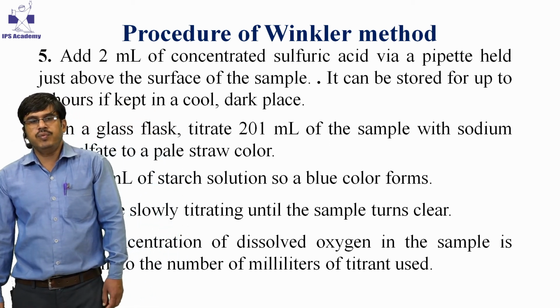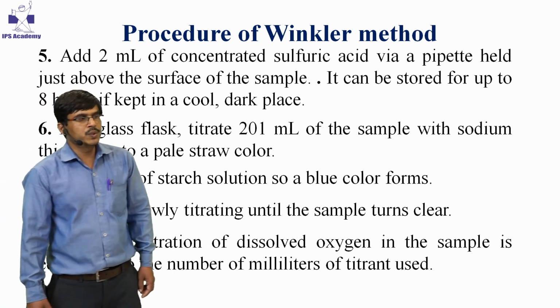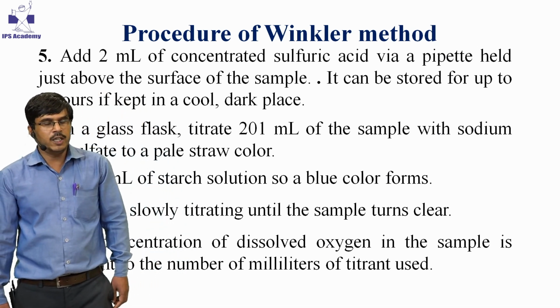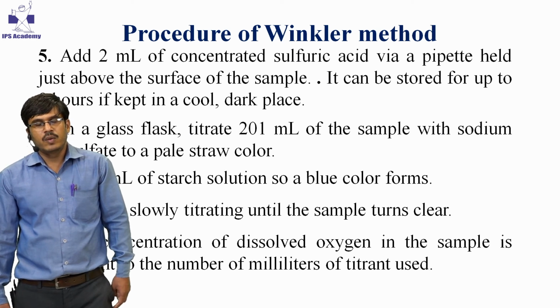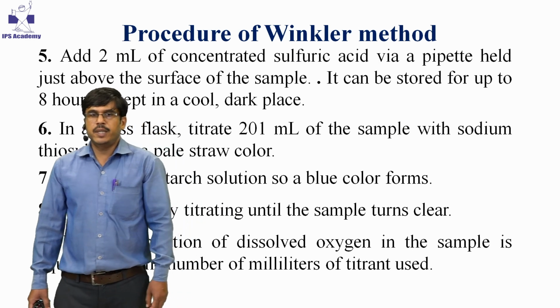The amount of hypo that is used for decoloration of the violet blue color will be directly proportional to the oxygen present in water.